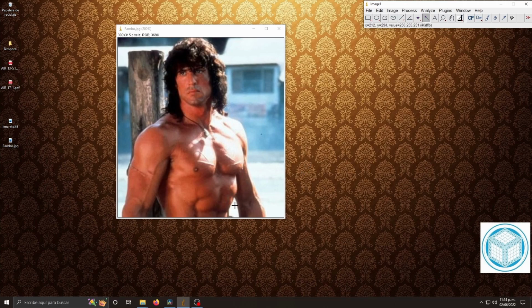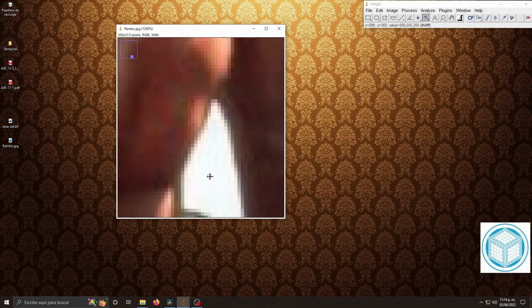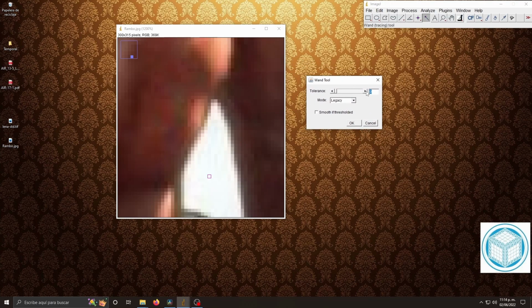Basically, a seed pixel or a small region is selected, and then this seed starts growing to adjacent pixels if and only if these pixels meet certain predefined intensity threshold. So if a neighbor pixel has an intensity value that exceeds the threshold, the region will not grow to that pixel, allowing us to select only the pigment spots in this case.